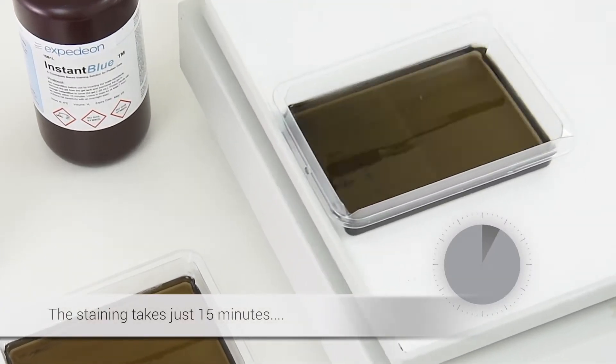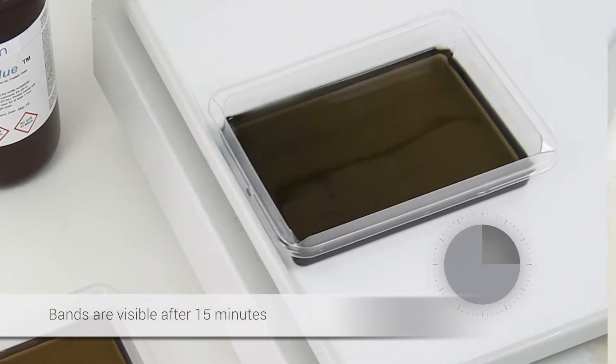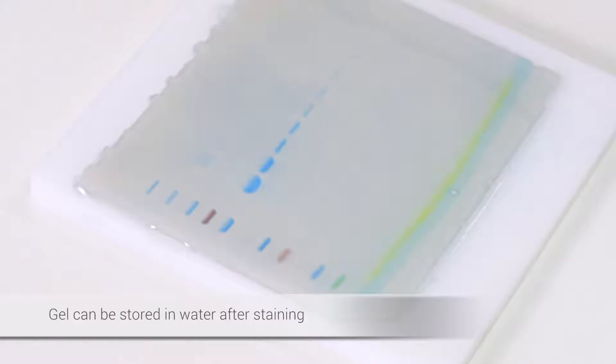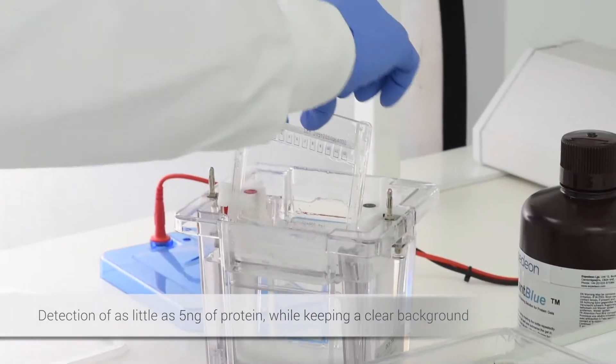The staining takes just 15 minutes. After staining, you can store the gel in water. InstantBlue's incomparable sensitivity allows the detection of as little as 5 nanograms of protein while keeping a clear background.